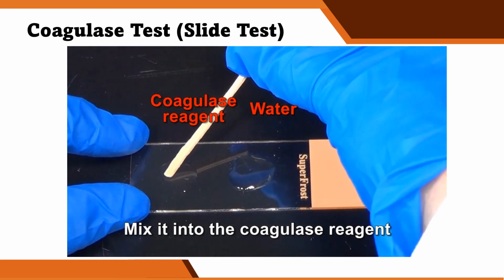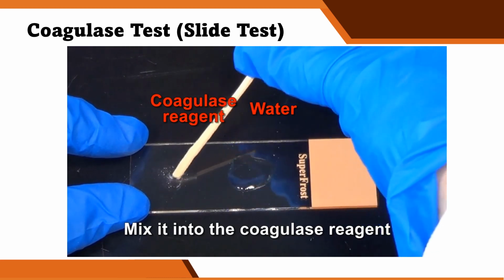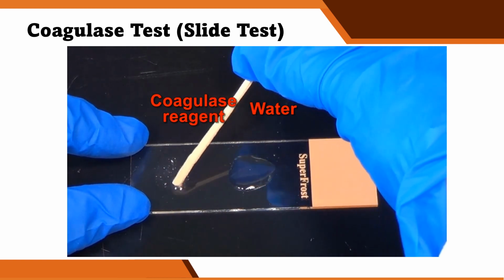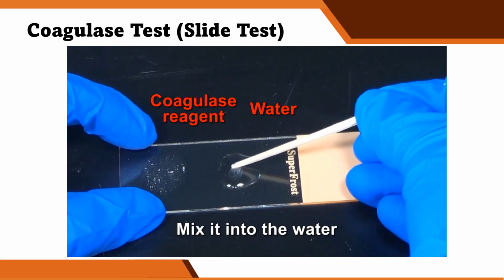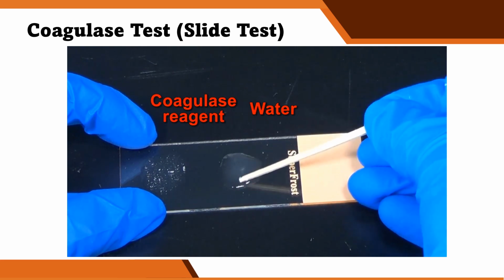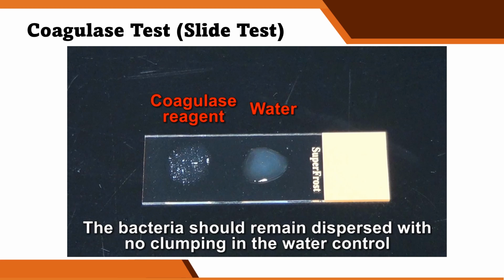Mix it into the coagulase reagent. Always include a control using the remainder of the selected colony dispersed thoroughly in a drop of water. A positive result is identified by the clumping of organisms after 1 minute. The control should remain thoroughly dispersed with no clumps. The control must show this result before the test can be read.